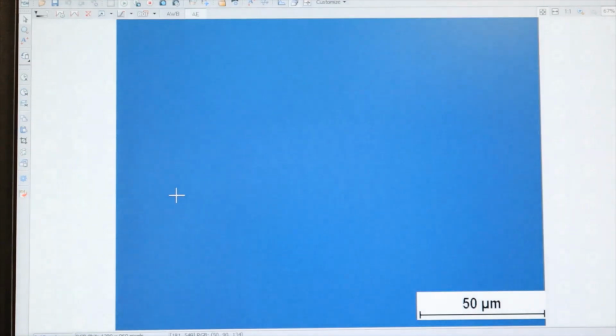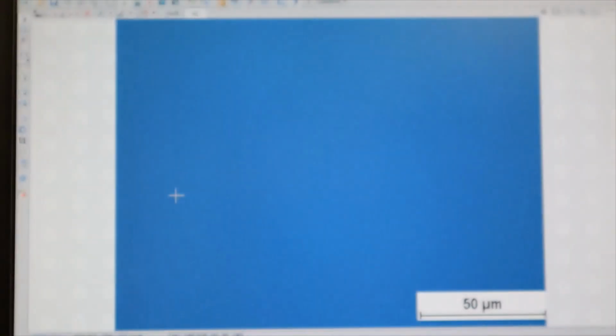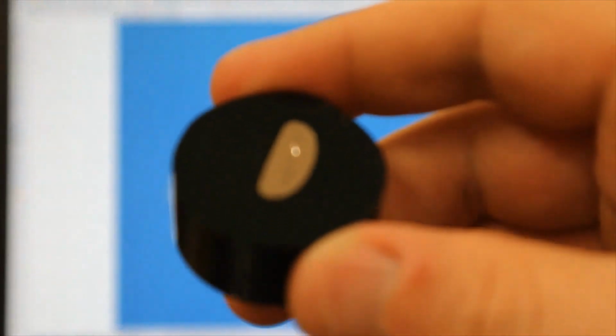I'm now going to go on the other side of the phase diagram. So we just looked at this guy, kind of orangish. Now we're going to look at this guy, which is much more silver. So we're going to go ahead and pop that on there. And our scale bar is no longer accurate.